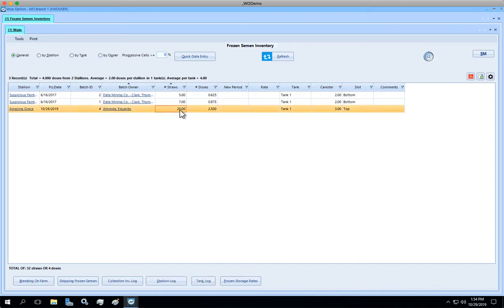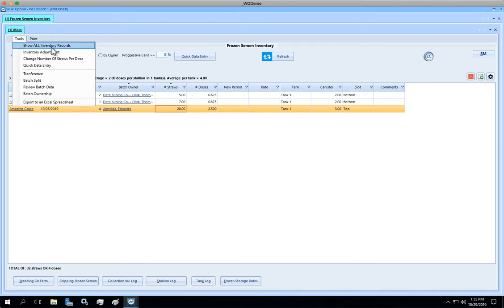I'm going to highlight one of the batches of straws, and next I'm going to ask you to click on tools, and here's where you're going to find some of the handy tools to operate and work with management in the Stallion inventory, frozen semen inventory.